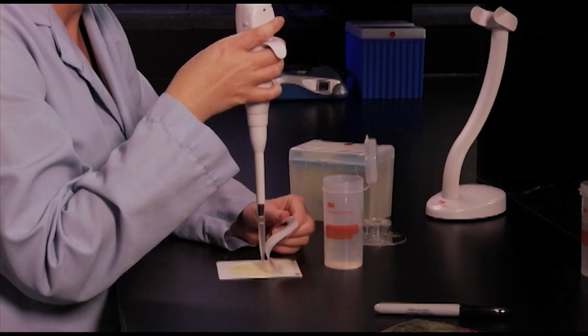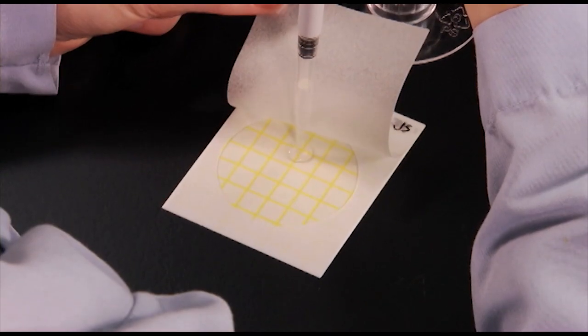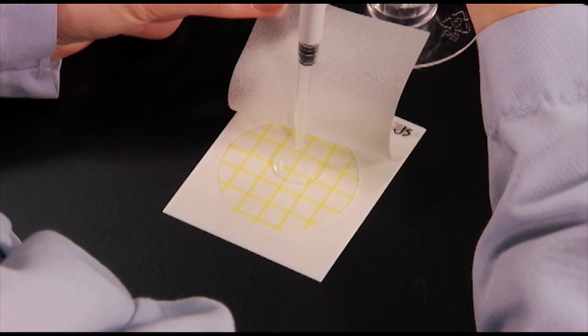Draw 1 mL of sample into the pipetter. Lift the top film and hold the pipetter perpendicular to the 3M PetriFilm plate. Pipet the sample onto the center of the bottom film.